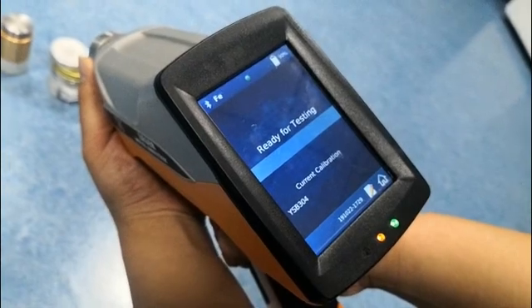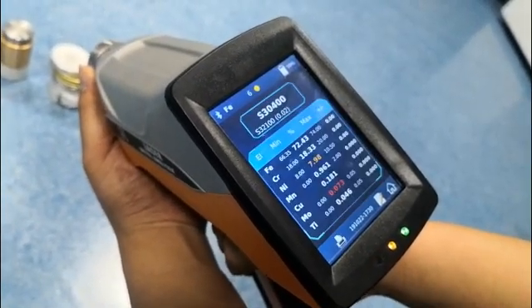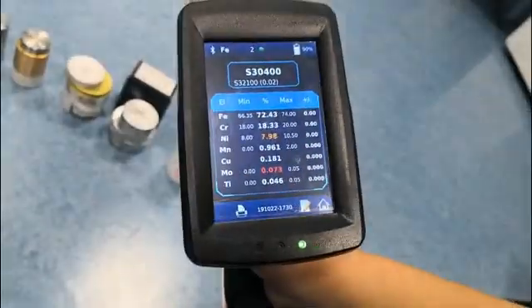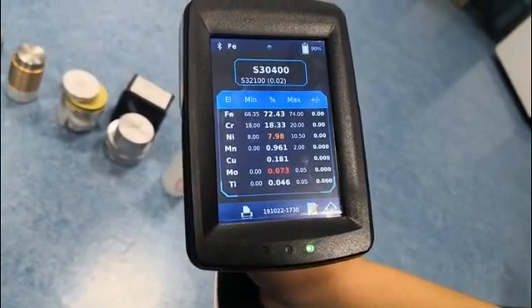Okay, test. In only one second the result is out, and we get the grade of the stainless steel — 304.